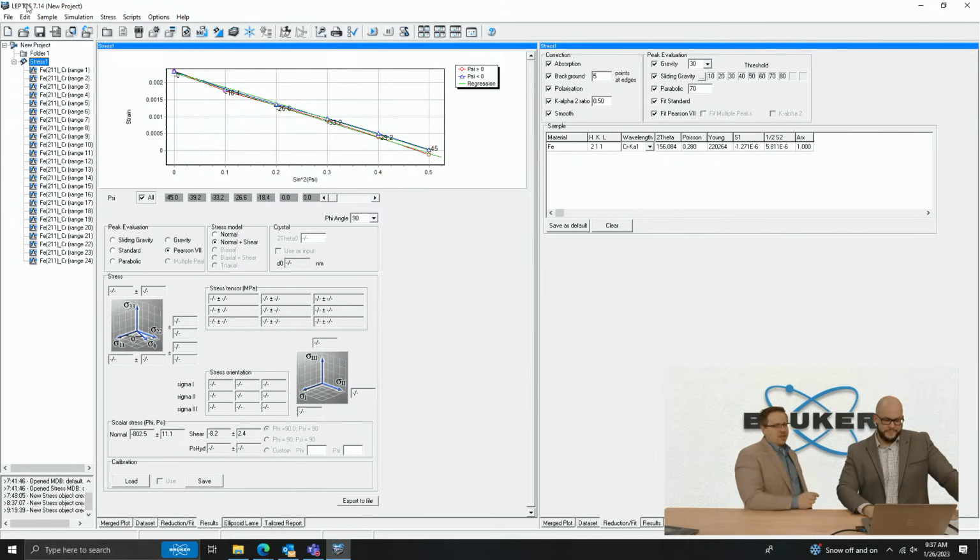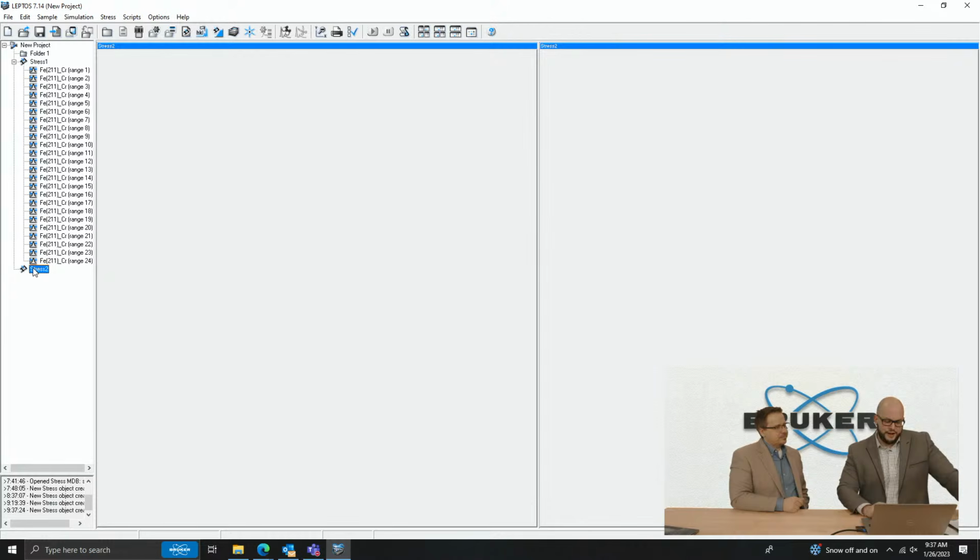But you had said that we have another example. We do. Let's try a 2D example. Go ahead and hit new stress.